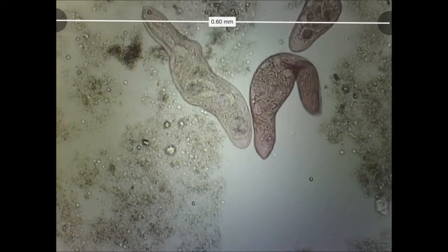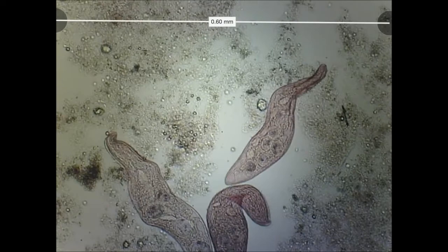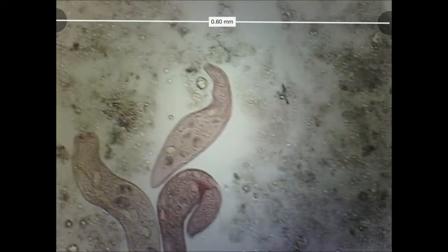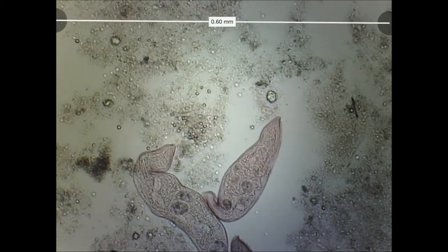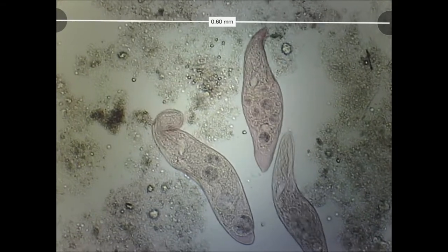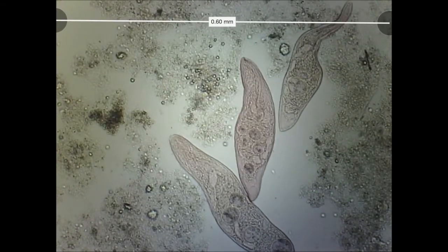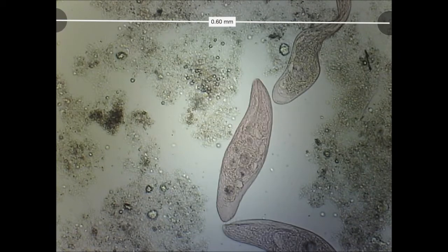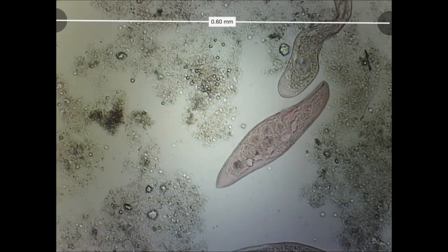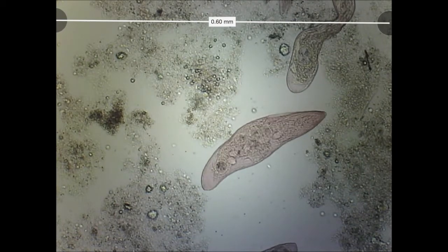You can see the one in the middle that just swam up there with its nuclei. The nuclei of these guys has that bead-like shape that we also see in stentor, so it's a little bit different from paramecium. We find out that they're like this in part because they do occasionally get very large.